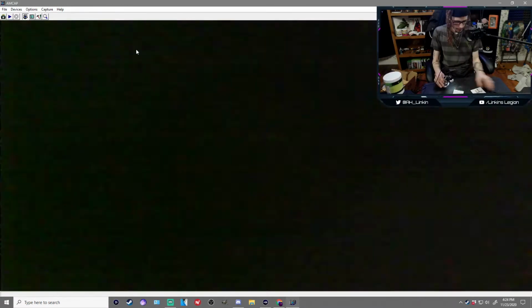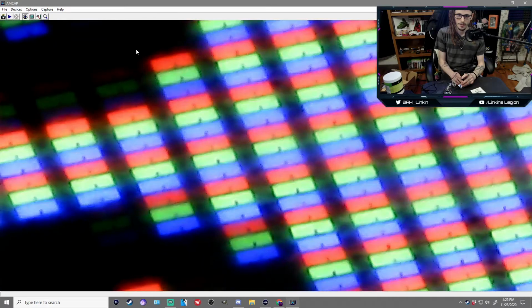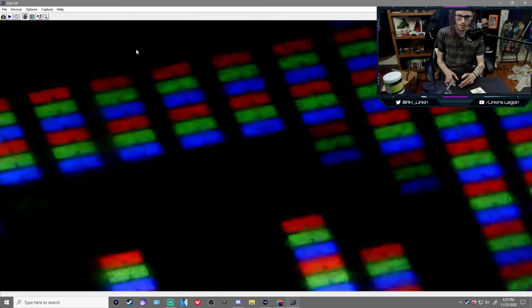Oh, perfect. Let's look at my iPod screen. So this is Somewhere I Belong by Linkin Park. Ooh. Alright, so now the brightness of the microscope is entirely off. Now it's just the screen of the iPod. Yeah, see, right there. That's what's making up white. That's making up the white background. That's literally default red, green, and blue hues.